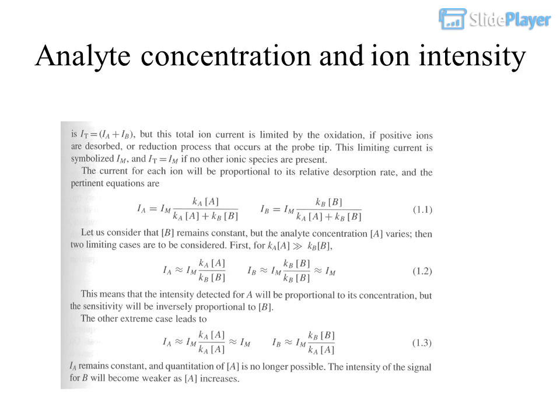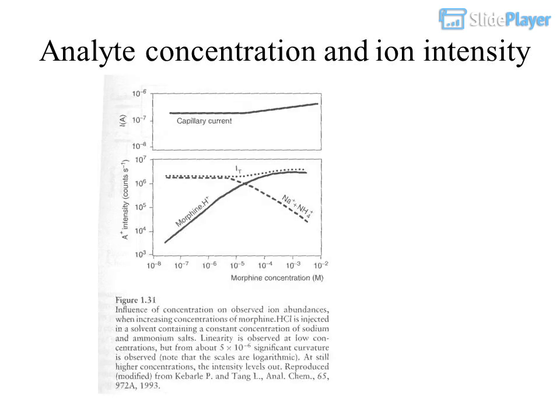Analyte concentration and ion intensity.